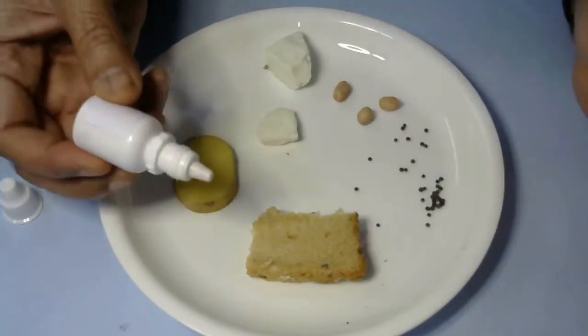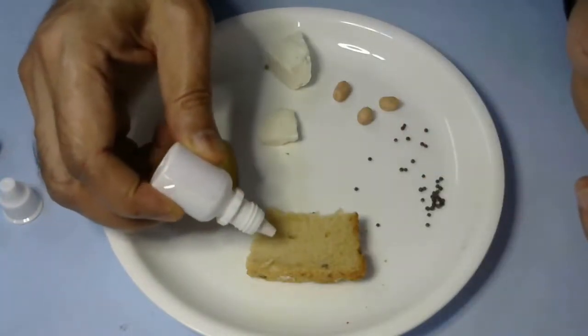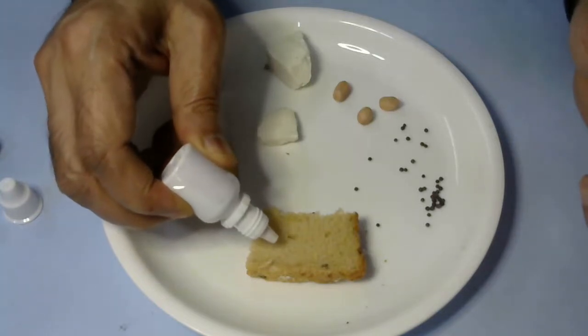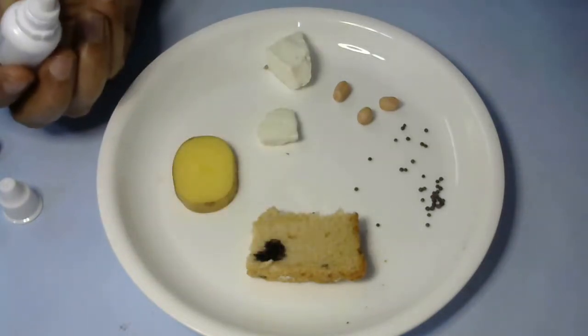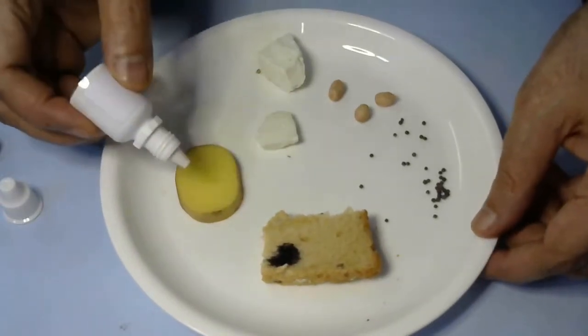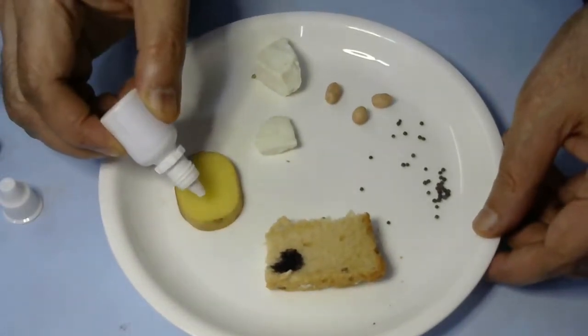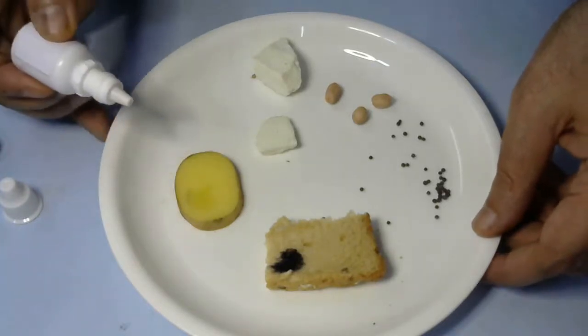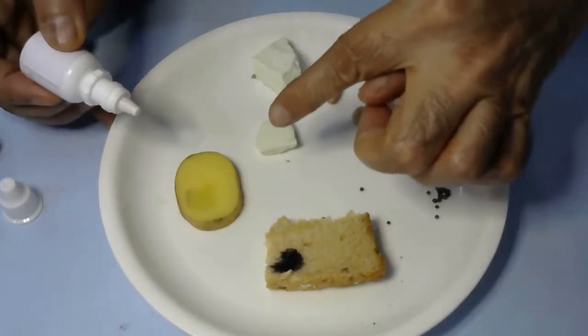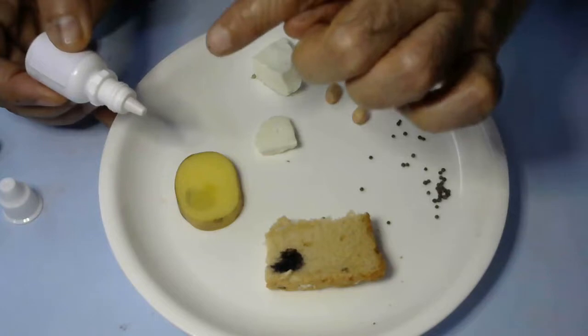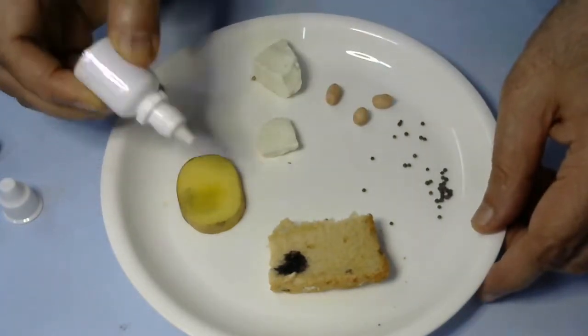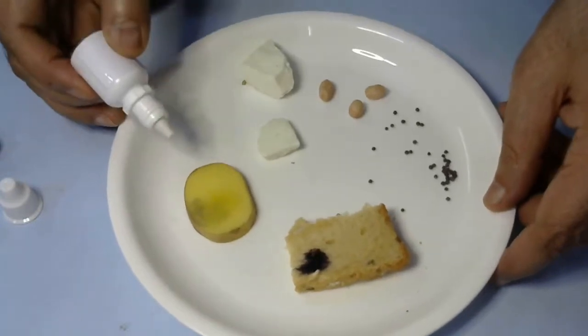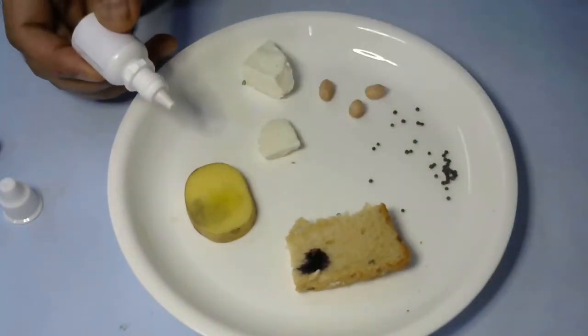Let's start with bread, which contains wheat flour. When we put a few drops, you'll see it instantly turns dark blue or black. Let's try this on potato. Potato also turns blackish, but it will take some time. Let's put a few more drops and wait. You can see it has started turning blackish.